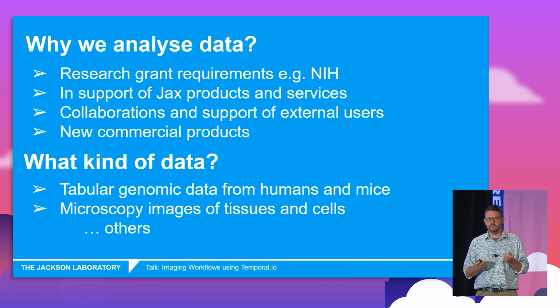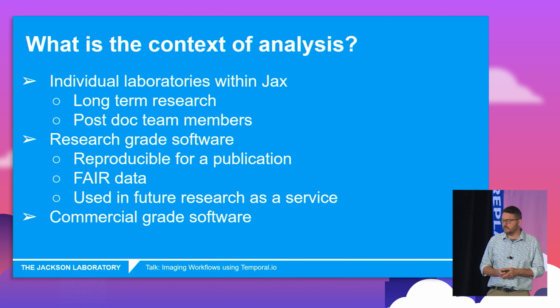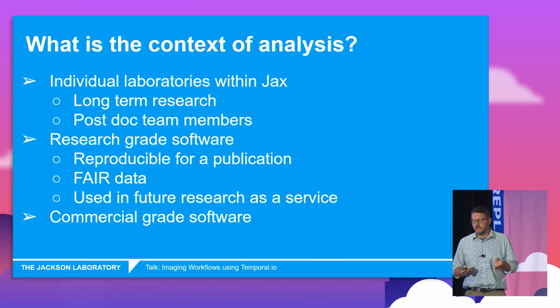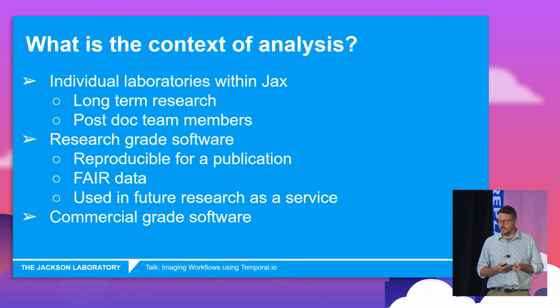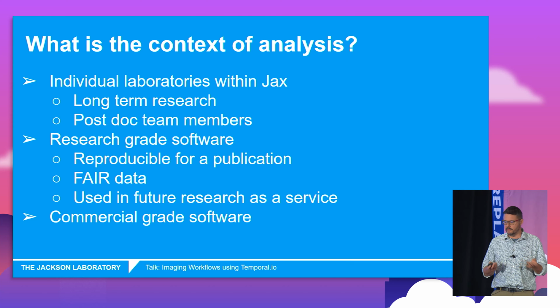Those are produced by very high resolution instruments, so they have an issue of scale, which I'll talk about. And Temporal helps with that. The context of the analysis is that individual laboratories within JAX will have long-term research and postdoc members working on different projects, and we'll be supporting them.